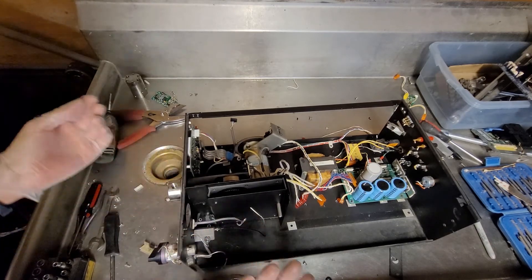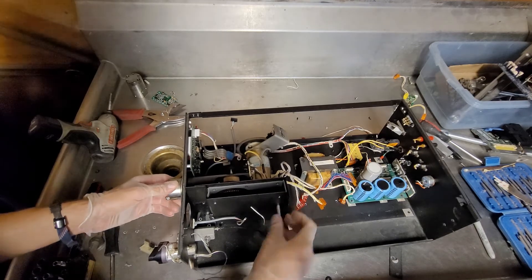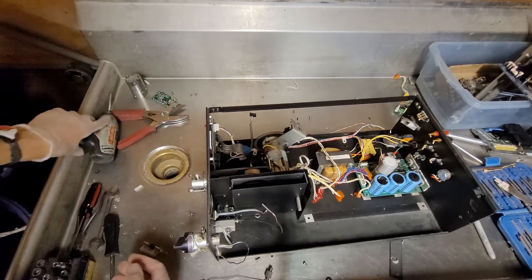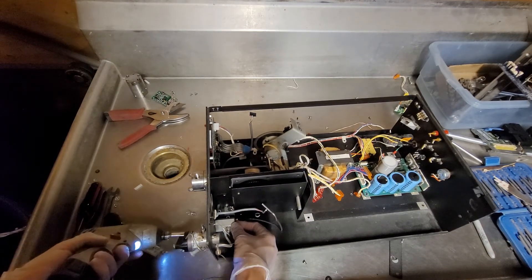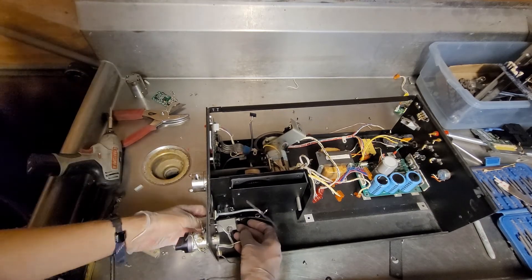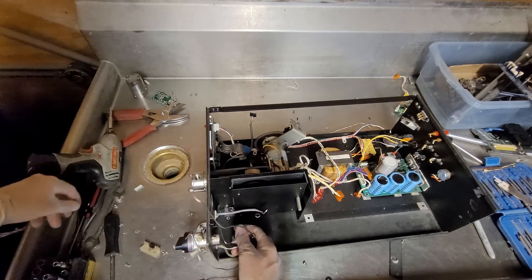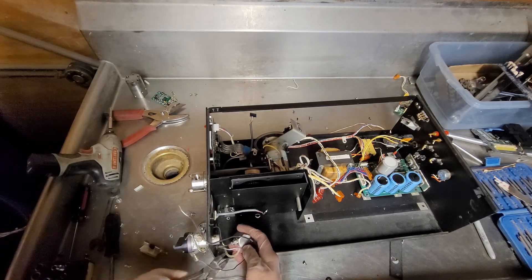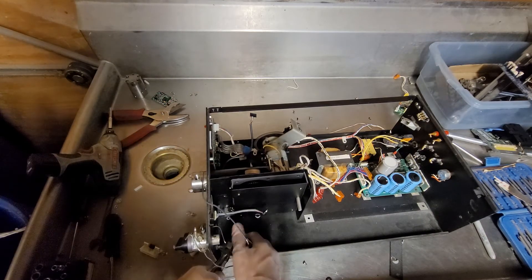Kind of a vinegar smell I'm smelling right now. That's precisely why I'm tearing this apart on the teardown bench — that's also where I take my photos for my eBay pictures.